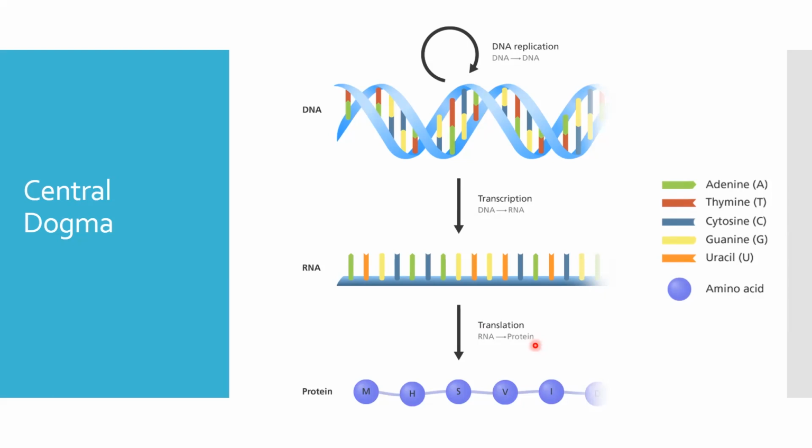This was a well-established fact. But very soon, scientists discovered the phenomenon called reverse transcription. Here, a specific enzyme is used that converts RNA to DNA. Reverse transcriptase PCR basically hinges upon this very fact that a few enzymes can make DNA once it is given the RNA template. So let's look at what reverse transcriptase PCR looks like.